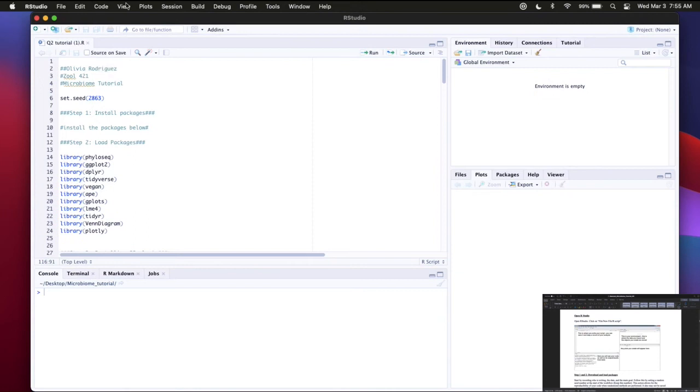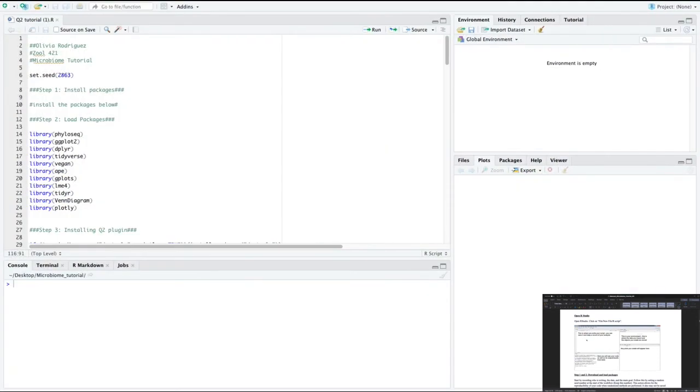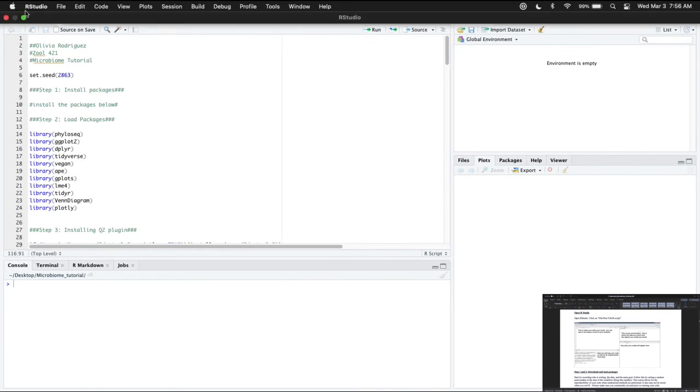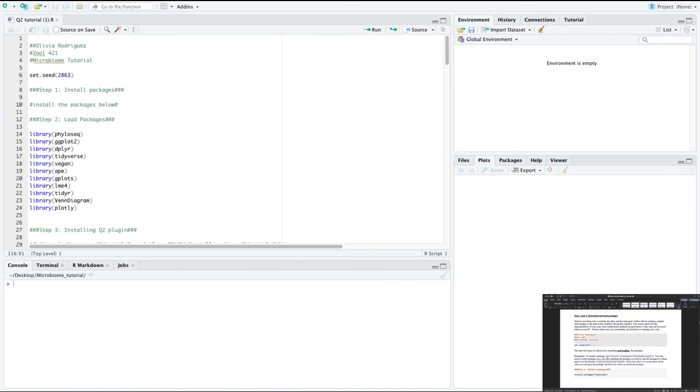So when you open RStudio, I already have the script loaded. So you'll click on File. Let's pretend you do it. File, New R Script. And then just a recap, this is from last week. You're going to download a lot more packages this week than you did last week. That's okay. So first, we always want to give descriptions of what we're doing.